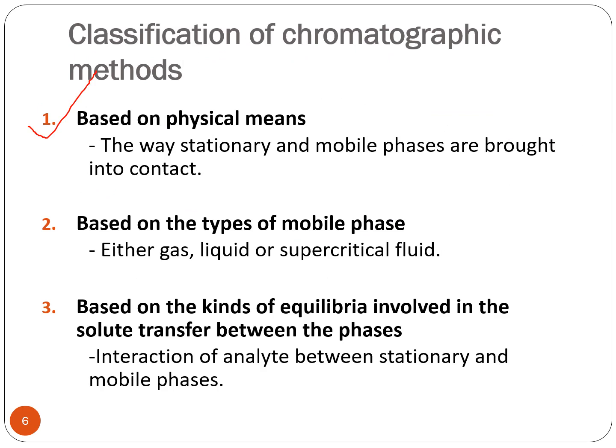Okay, the way stationary and mobile phase are brought into contact. Macam mana stationary dan mobile phase ni meet with each other. Okay, whether it is through column chromatography or planar chromatography.